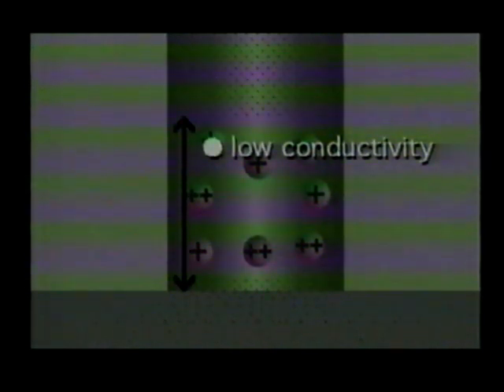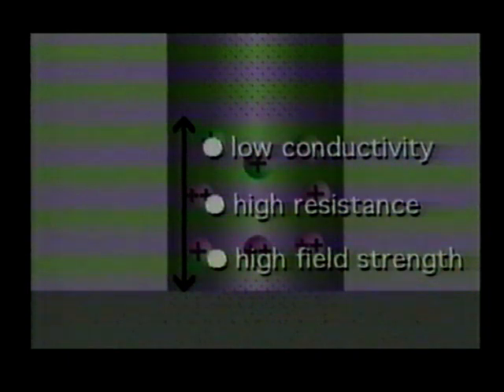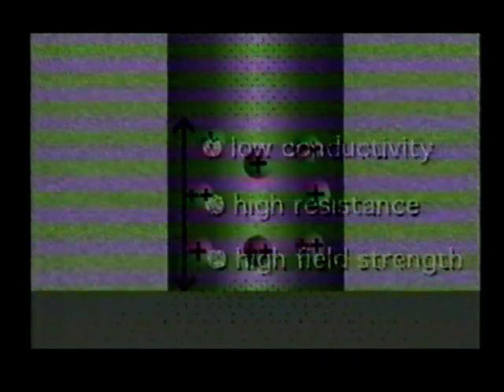Concentration of the analytes can be achieved by having a sample solution with a lower conductivity than that of the running buffer. In fact, when using hydrodynamic injection, the sample can be dissolved in pure water. Under these conditions, a disproportionate percentage of the total voltage drop along the capillary occurs across the sample slug, due to its higher resistance relative to that of the running buffer.